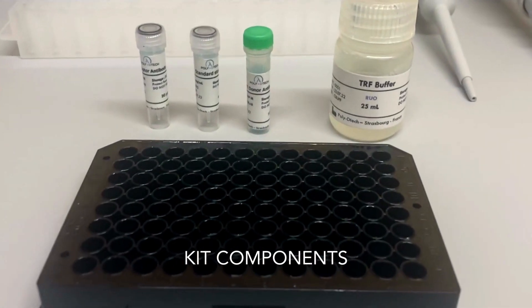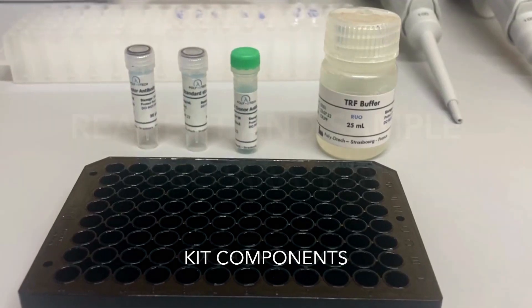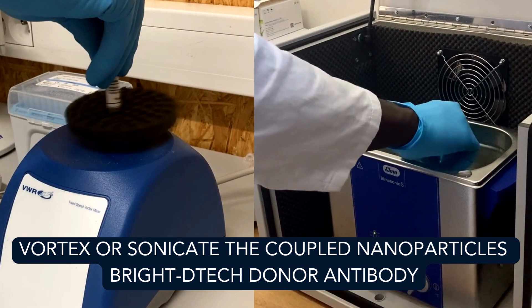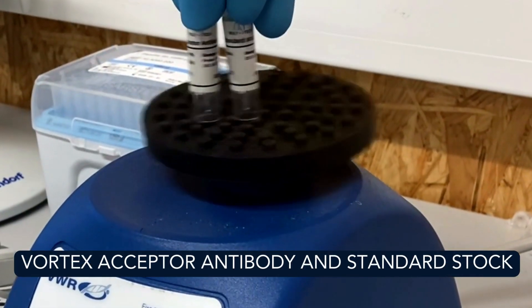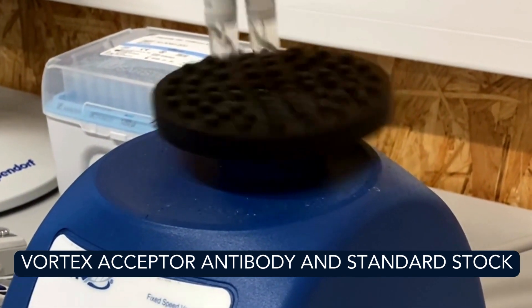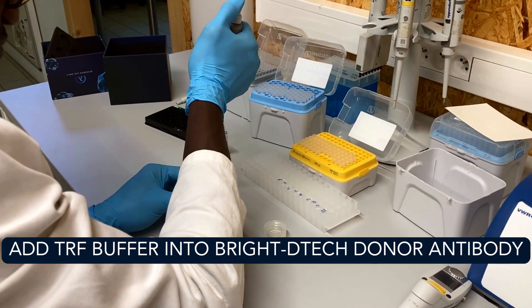Before starting, ensure that the solutions are prepared according to the protocol provided. Vortex or sonicate the coupled nanoparticles Bright-Detect donor antibody, vortex or sonicate the acceptor antibody and standard stock solutions. After sonication, prepare the antibody solutions.